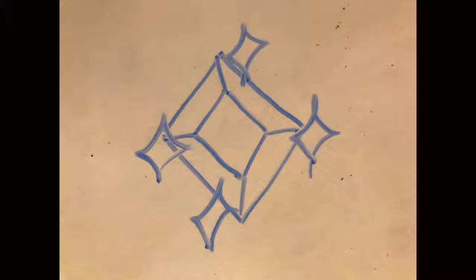We can find more information about the properties and structure of a certain crystal by performing some calculations with the equation 2d sin θ = nλ, which signifies the relationship between wavelength, which is λ, the distance between the planes in the structure, which is d, the difference in path length in the lower path of light, which is n, and the angle at which X-ray light passes through the planes, which is θ.